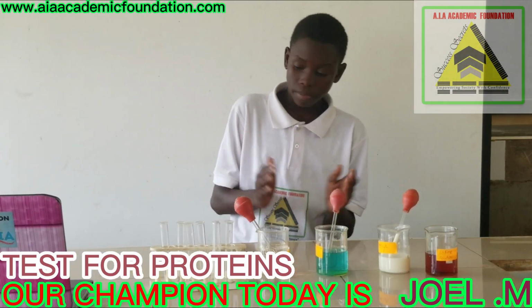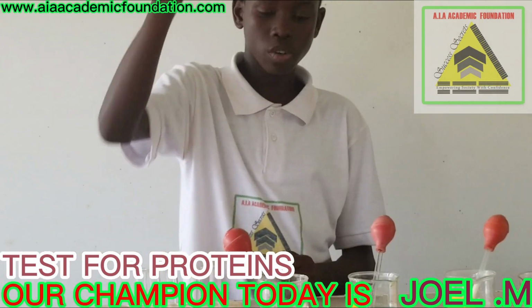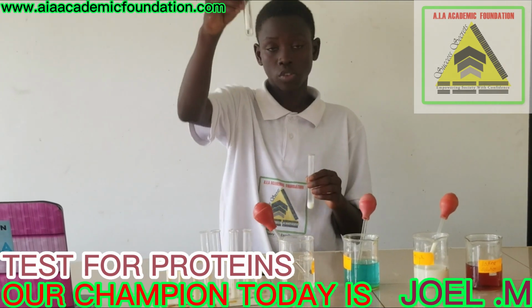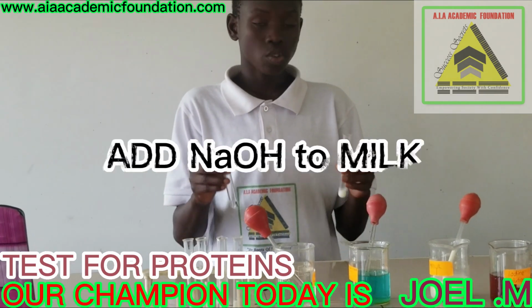I'll start by getting 1 centimeter cubed of milk and 1 centimeter cubed of sodium hydroxide. Then our first step is to add.